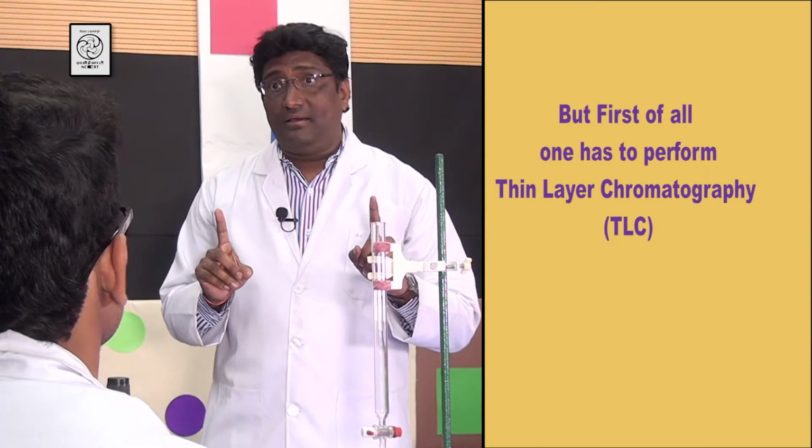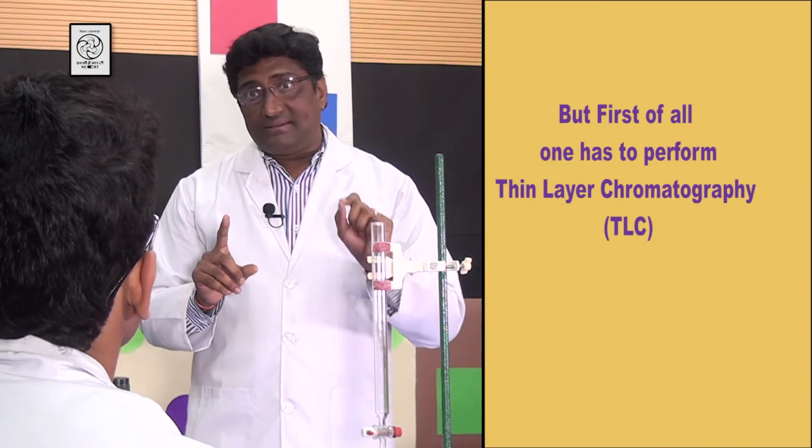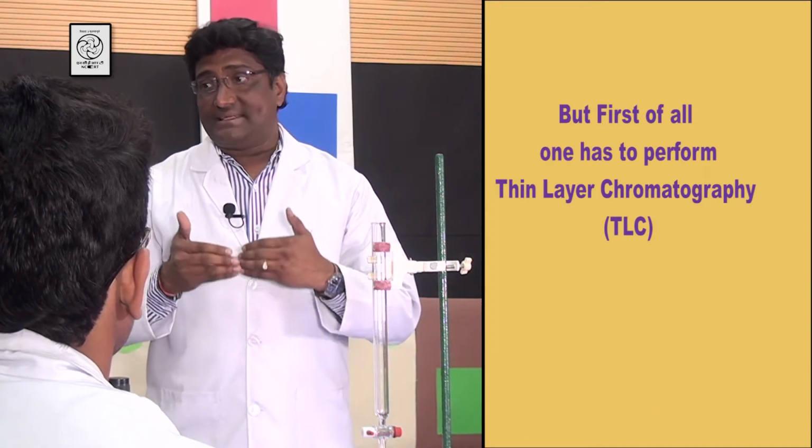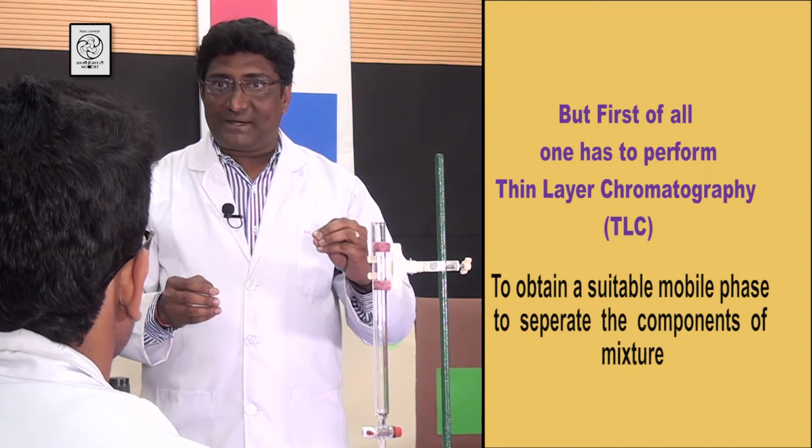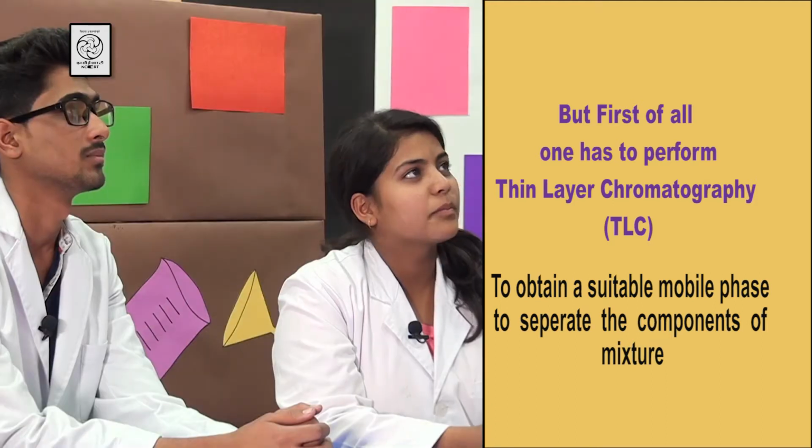But first of all, you need to perform thin layer chromatography, TLC, to obtain a suitable mobile phase to separate the components of the mixture well.